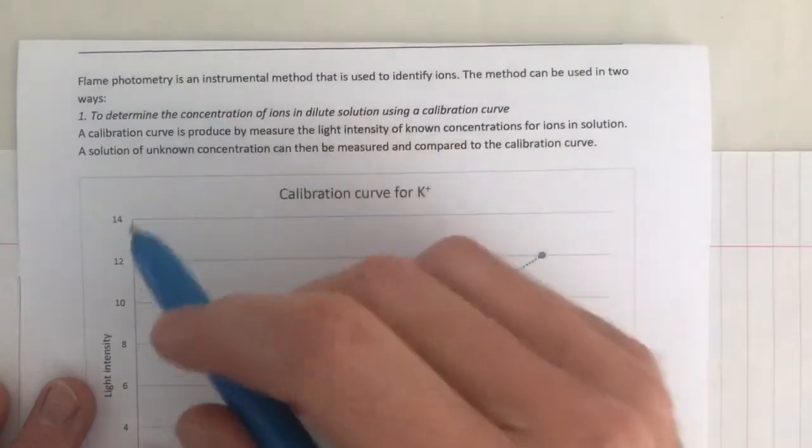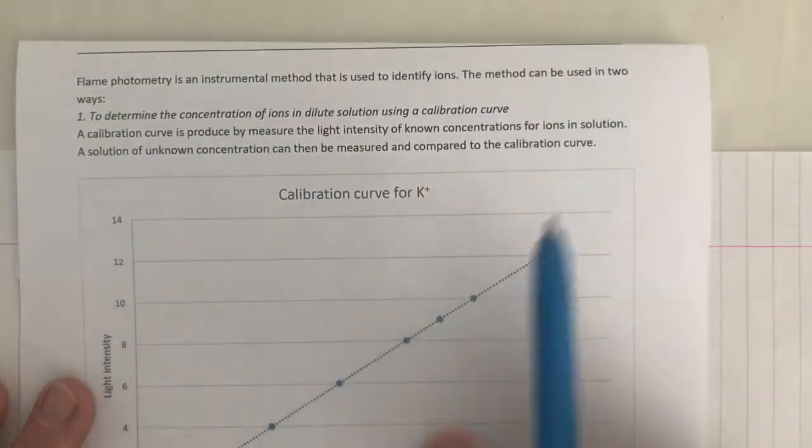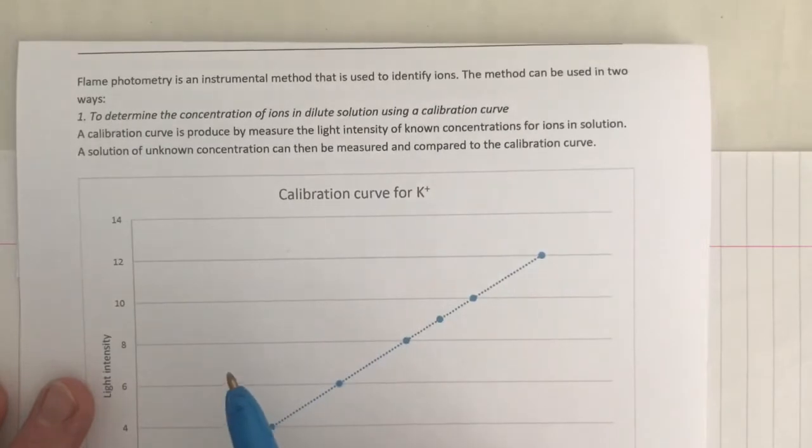And there's two ways, as I said. This is the first way. First way, we use a calibration curve, as you can see here. And we will use the calibration curve to find the concentration of ions in an unknown solution.